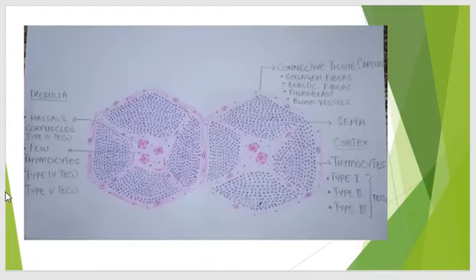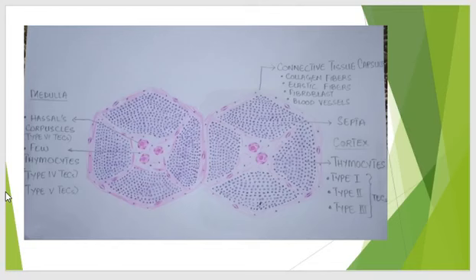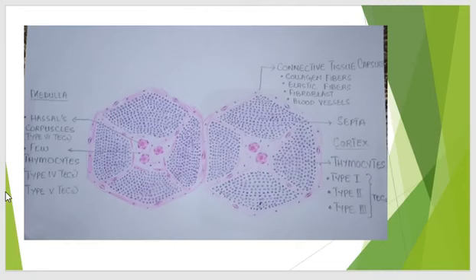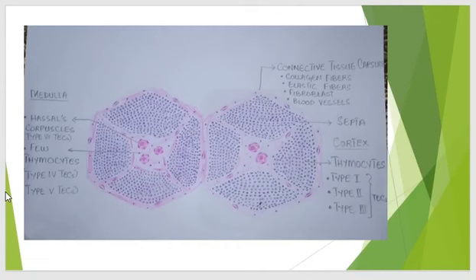In the histological diagram of the thymus, we can see two lobes surrounded by a connective tissue capsule containing collagen fibers, elastic fibers, fibroblasts, and blood vessels. Trabeculae or septa arise from this capsule and divide the lobes into incomplete or indistinct compartments. In the cortex, thymocytes and type 1, 2, and 3 thymic epithelial cells are visible, with the cortex appearing darkly basophilic. In the medulla, Hassal's corpuscles made up of type 6 thymic epithelial cells are present, along with fewer thymocytes compared to the cortex. This concludes the lecture.